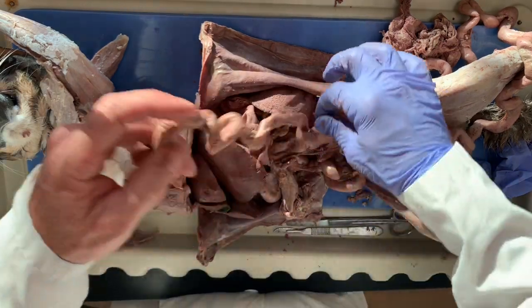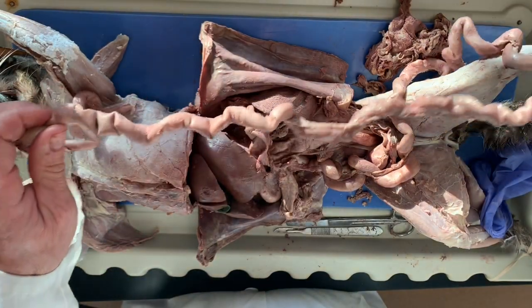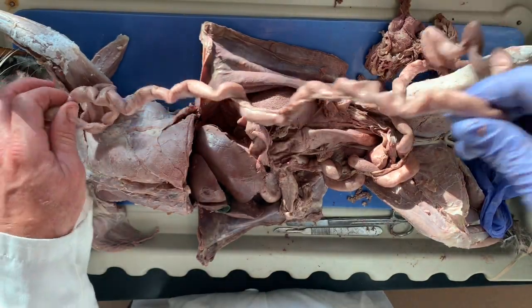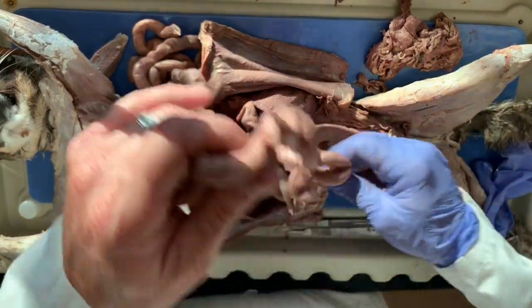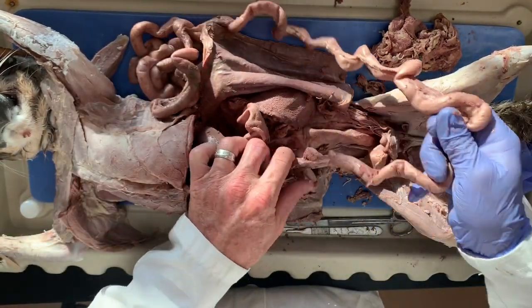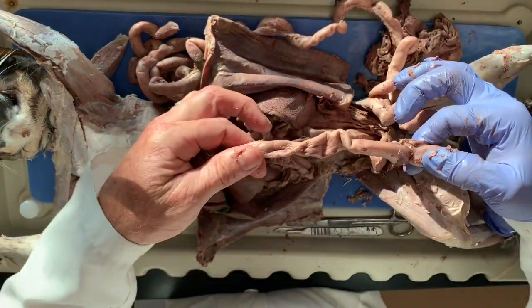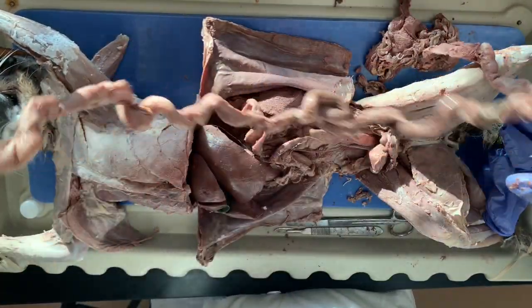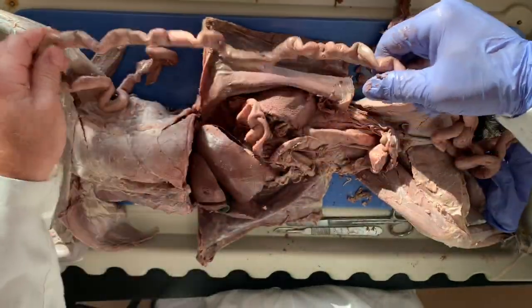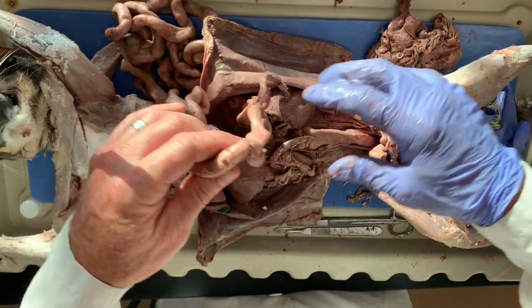Okay, so the ileum is the last part. There's no clear demarcations. The jejunum is in the middle part, and actually most of it is jejunum. And then the upper part right here is the duodenum. So the duodenum is the smallest, the jejunum is probably the biggest, and then the ileum is at the end. Okay, so you can see how much intestine this cat has. I mean, it's pretty extensive, right?